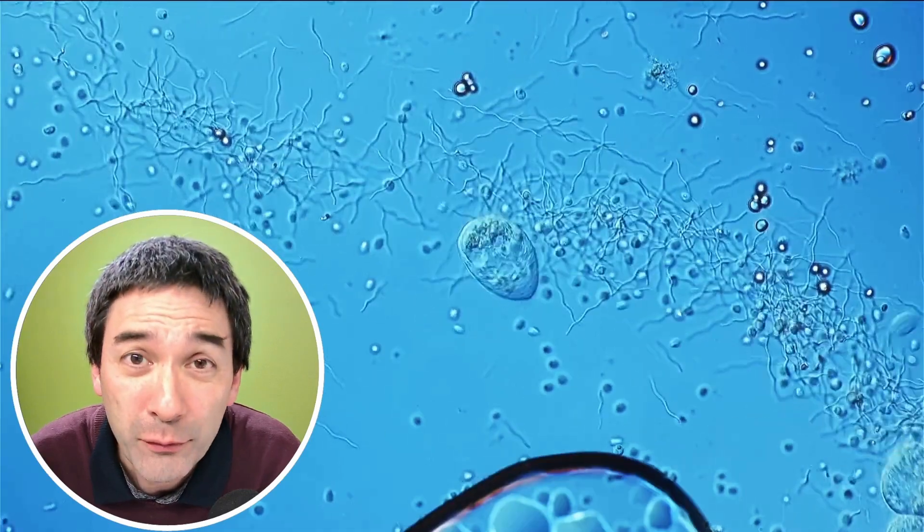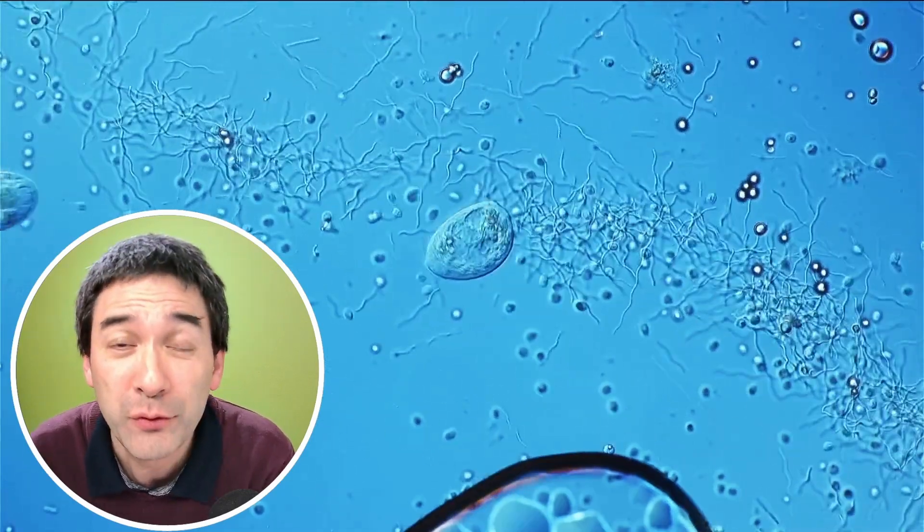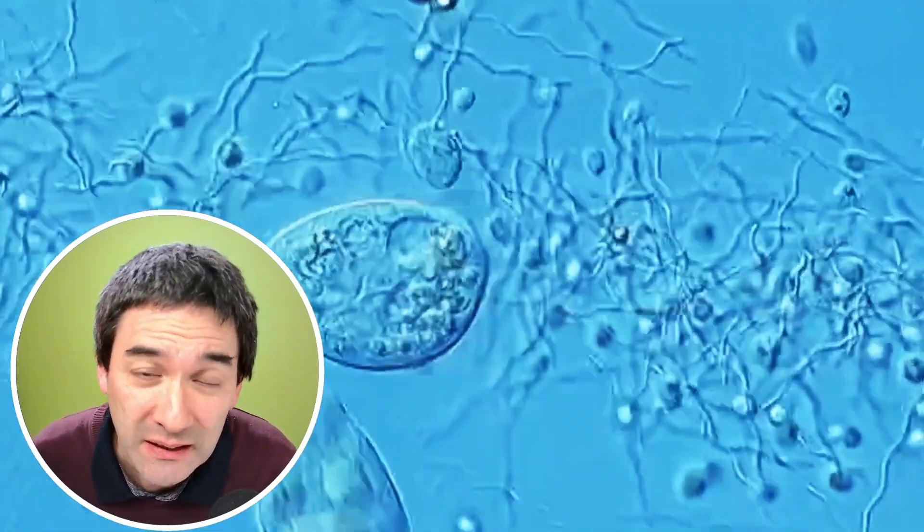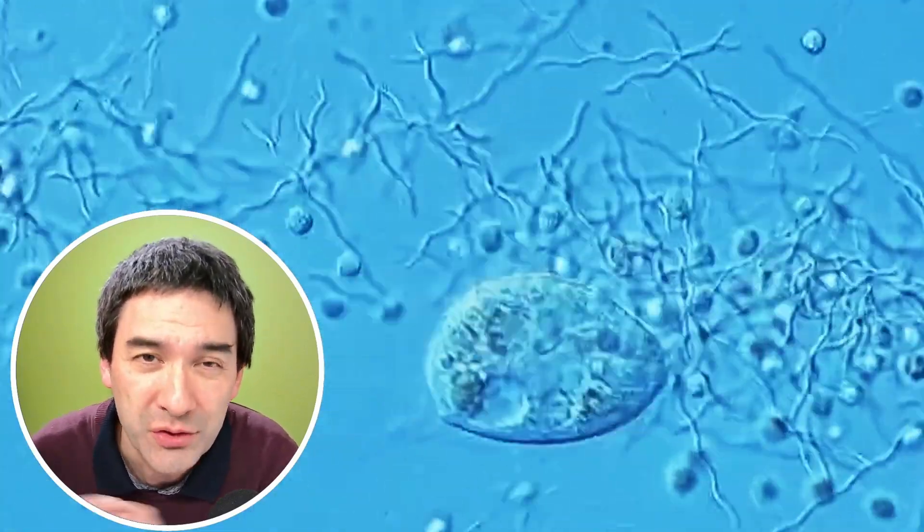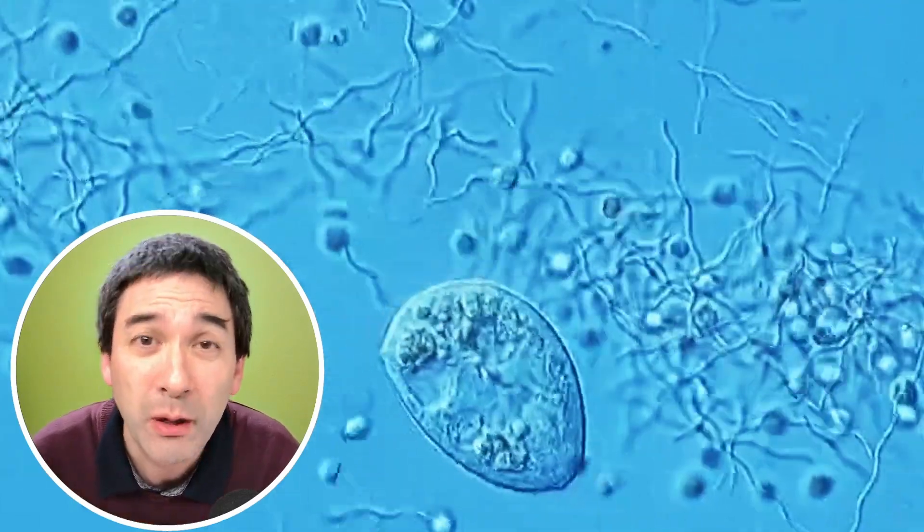Well, I added a little bit of food to the water sample that I collected from a local pond, and after a few days I did not only find a whole bunch of paramecia and those other ciliates swimming around, there are also small tiny ones there as well, but also a whole bunch of these spiral-shaped bacteria.